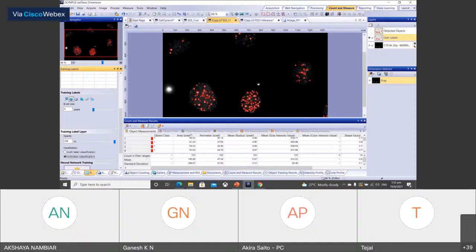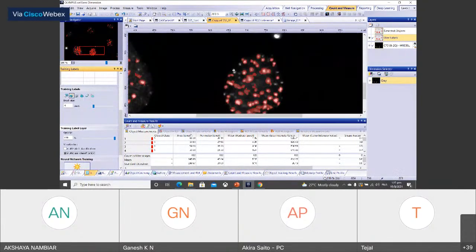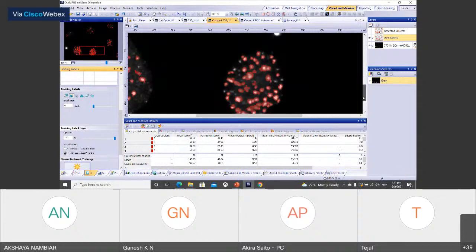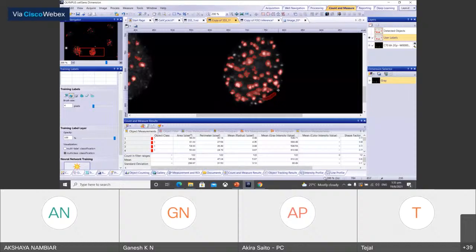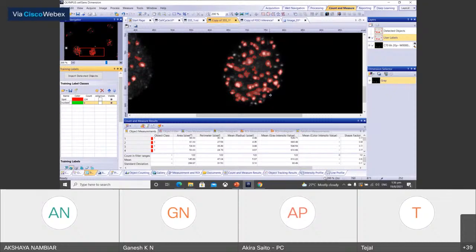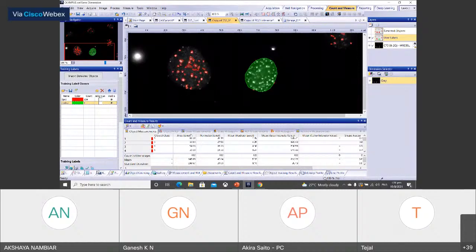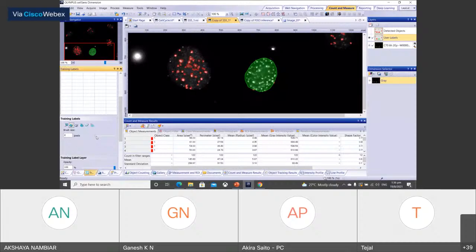It is a bit difficult to do this using the threshold, because for this nucleus, I think the nucleus is like this, and it is quite difficult to use the intensity information to identify where the nucleus itself is.